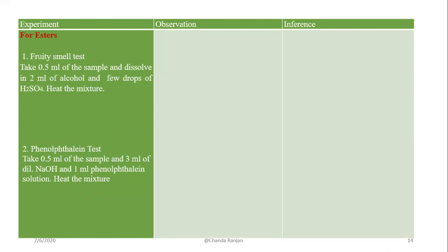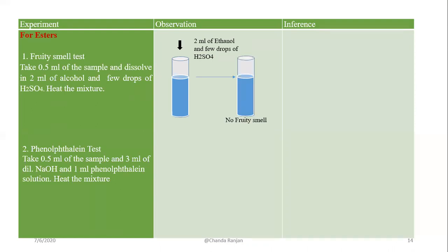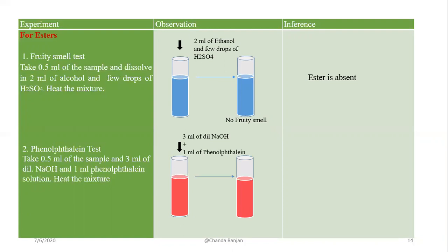We will first test for esters. We take the compound, add 2 ml of ethanol and a few drops of sulfuric acid — no fruity smell is observed, indicating ester is absent. We have another test for esters: the phenolphthalein test, in which we add 3 ml of dilute NaOH and 1 ml of phenolphthalein. The color of the phenolphthalein was not discharged, confirming ester is absent.